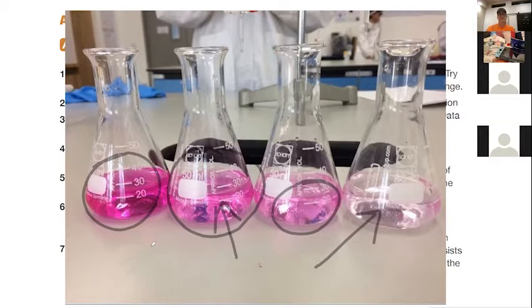These experiments don't really take a whole lot of time to do. You'll see the first one takes a long time because we want to be really, really careful. The second time we do it, we're going to be doing these in triplicate, and we're going to have a pretty good idea of the volume we need. So we can get to that volume fairly quickly and then slowly go drop by drop. But that first one you do should be really, really slow and careful. I mean, they all should be careful, right?